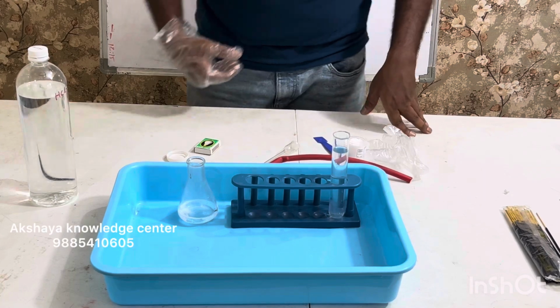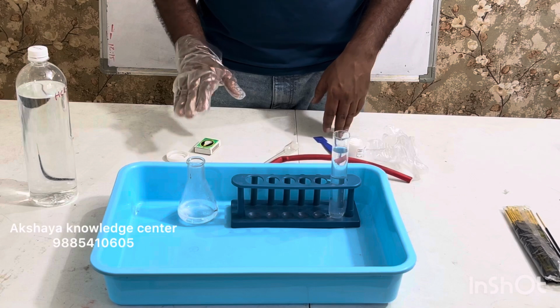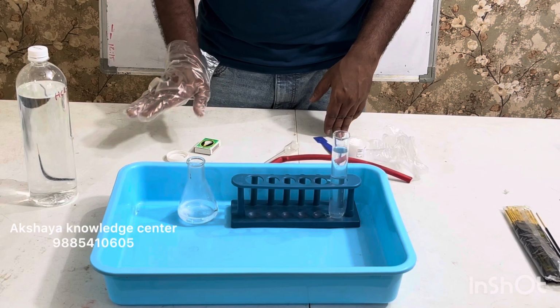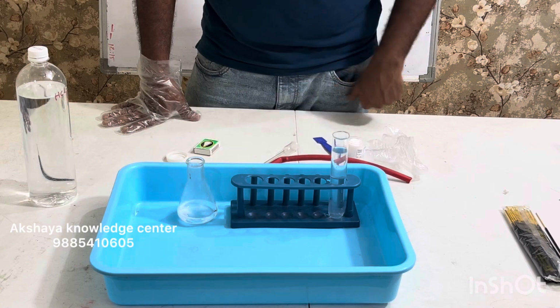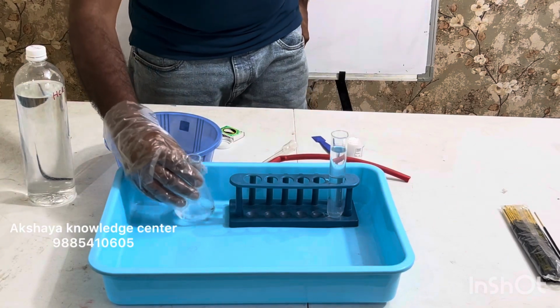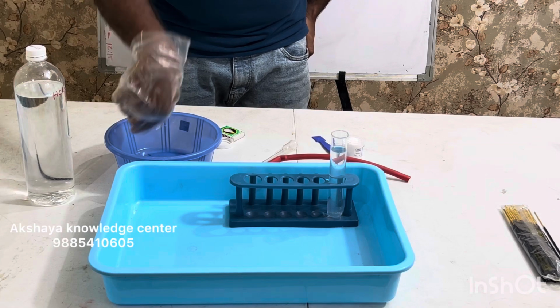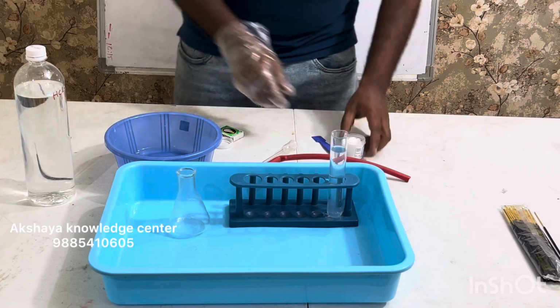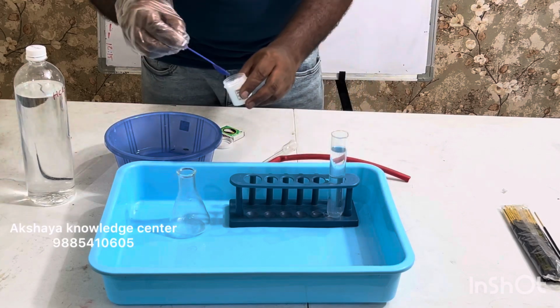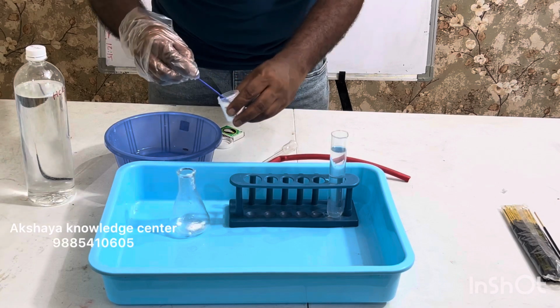Now let's go ahead and do the next part of the experiment. I want to start fresh, and for that, I will first pour away this liquid and then I'll continue. So I'm pouring away this entire mixture here. I don't need it anymore. I want to start fresh. So I'm adding fresh calcium carbonate in here.